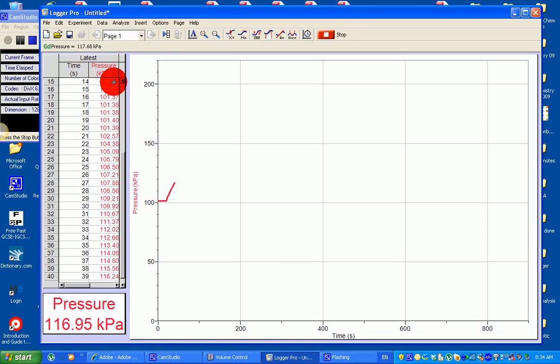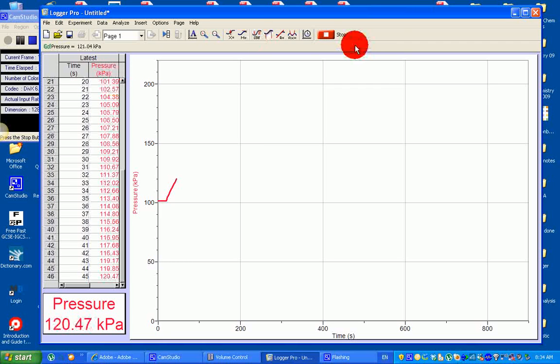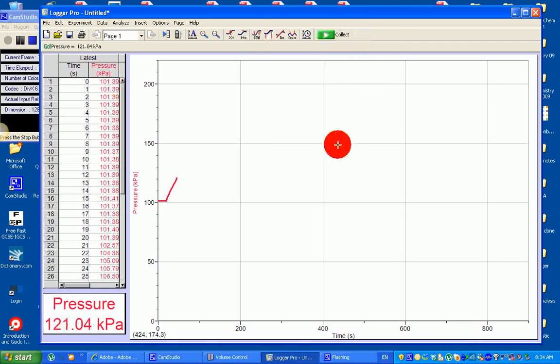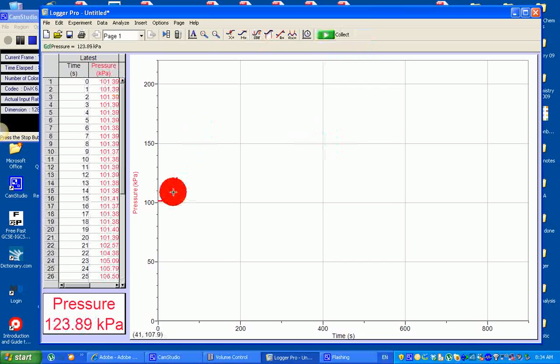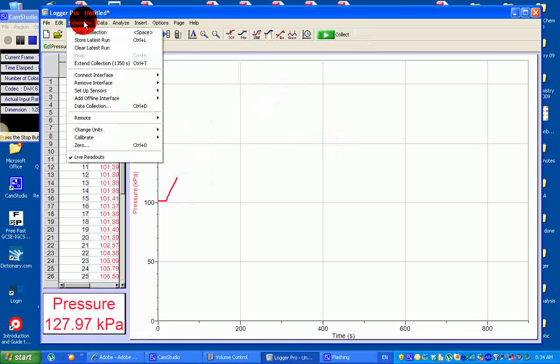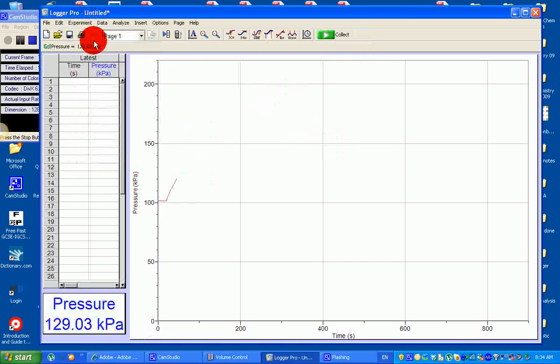I'm going to stop my data collection and press the stop button. This is a reaction between hydrochloric acid at 0.5M with magnesium strip. I got my first data — get into experiment and store my latest run.